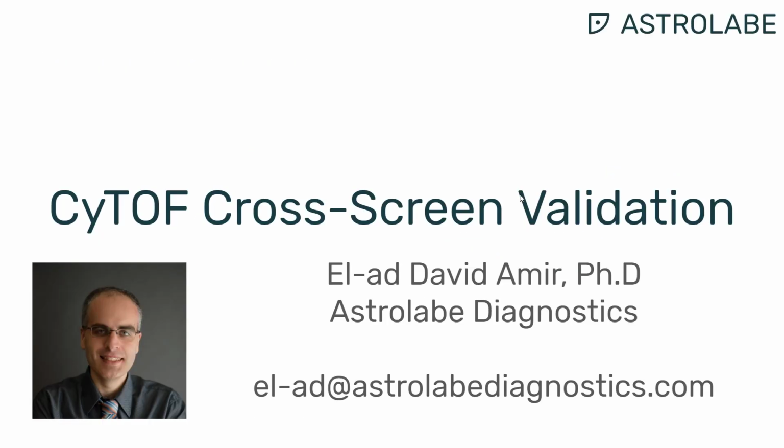So just a quick summary, we've taken two different screens here. One is the ASDS, publicly available online, link at the bottom. The other one is from Sean Bendel's group, the Glass et al. paper, and the overlap between them is pretty high.